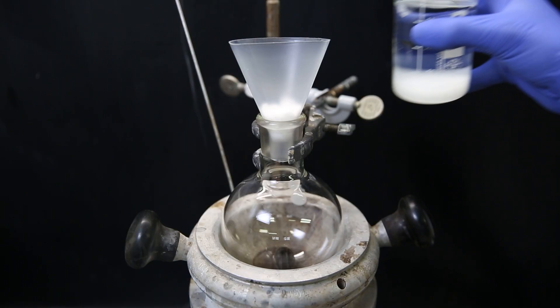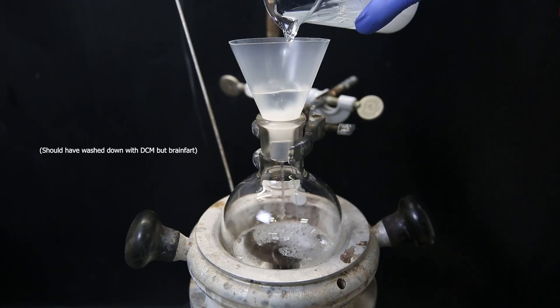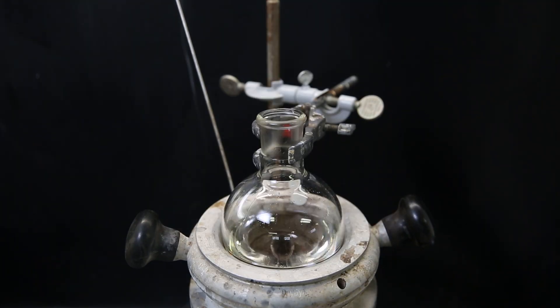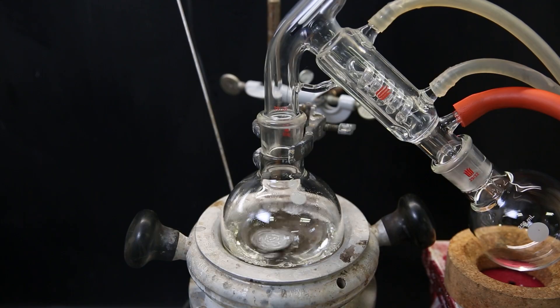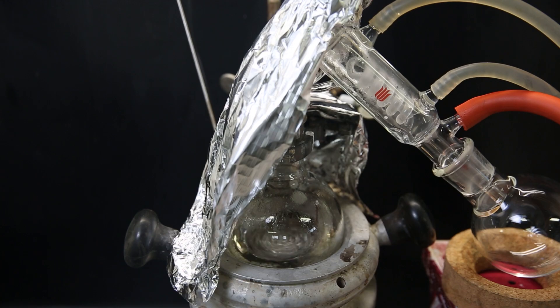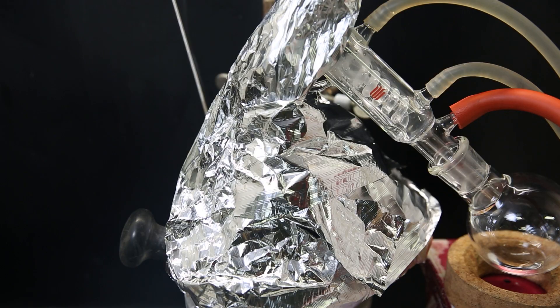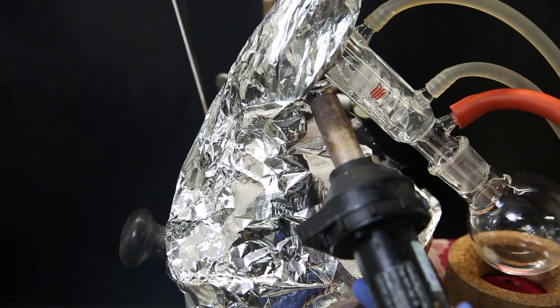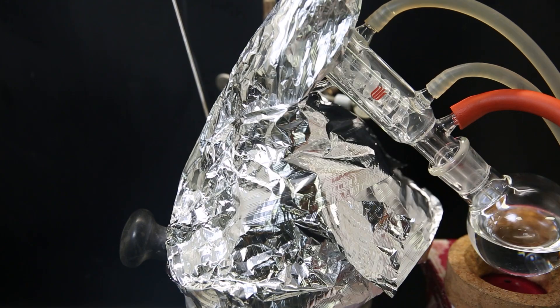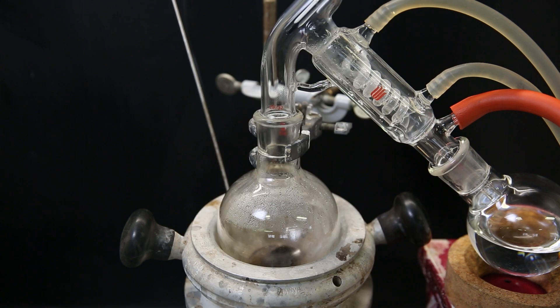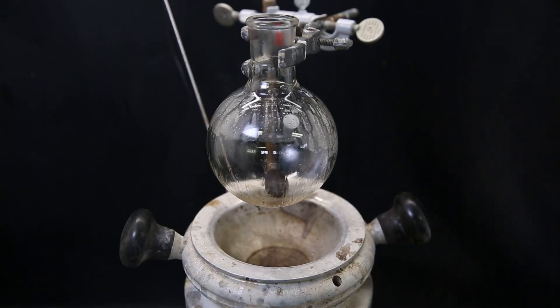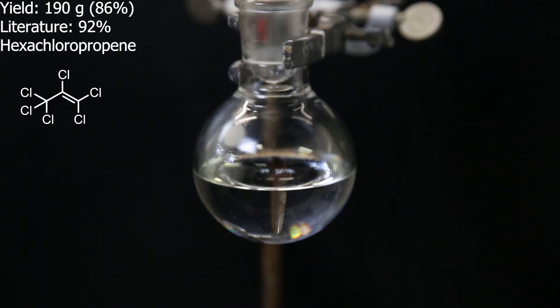I filter it through some cotton directly into a flask and then set the flask up for short path vacuum distillation. First I distill off the DCM and then swap the receiving flask, increase heat, and start distilling over the product. I assisted slightly with a heat gun. And after a while all of the product had come over as a clear liquid and only some brown stuff remained in the flask. The yield of hexachloropropene turned out to be 190 grams or 86%, which is slightly lower than literature but it's still good.